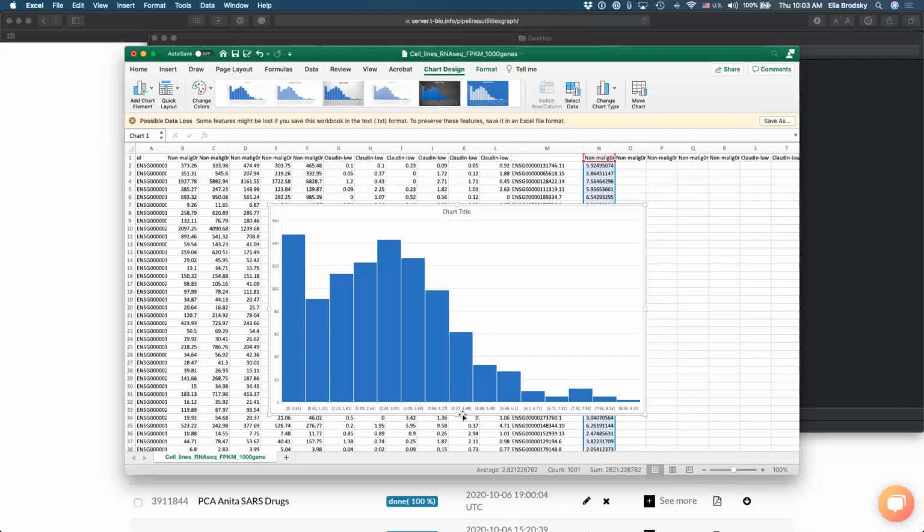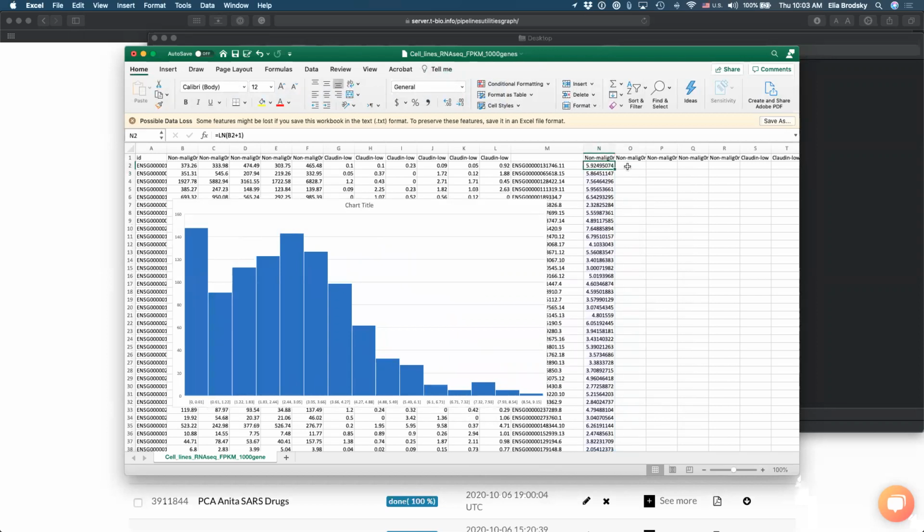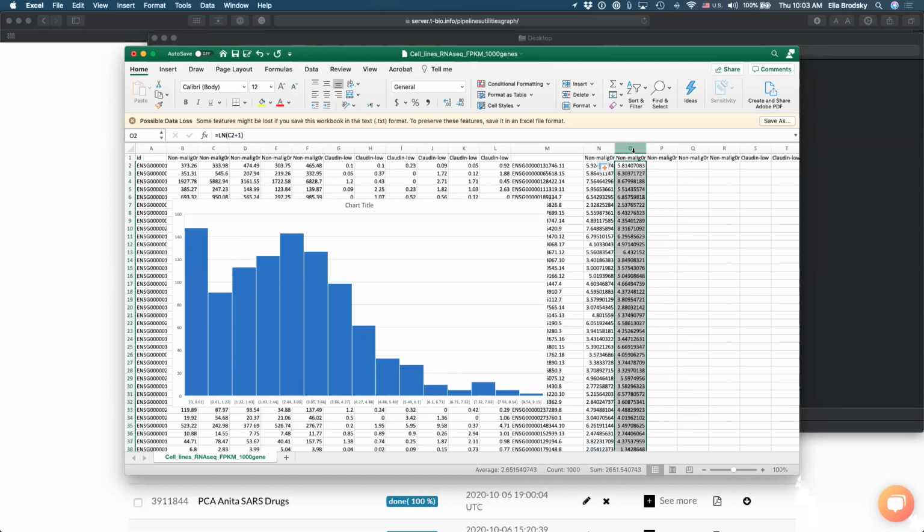So this is from 427 to 549. So we chose 5 as the threshold. So right here would be the threshold. So everything above would not be normalized. Everything below would be normalized. Normalization doesn't really change it. It just aligns distributions. So with normal distributions like this, if I take the first sample, and then I just take the second sample, etc., I will see that the humps should be comparable. I'm not expecting one to be dead and another one to be alive. But the significant signal, this signal right here, is going to be different. Does that make sense, Genova?